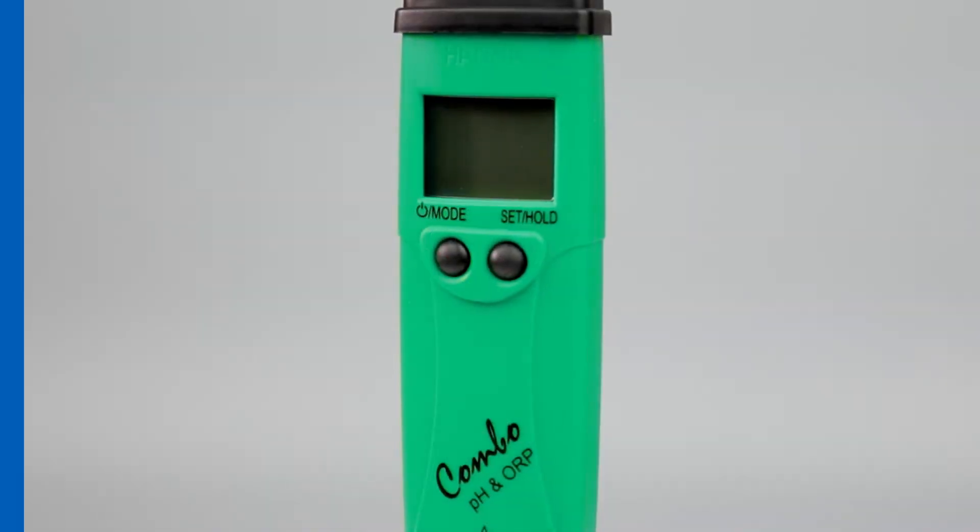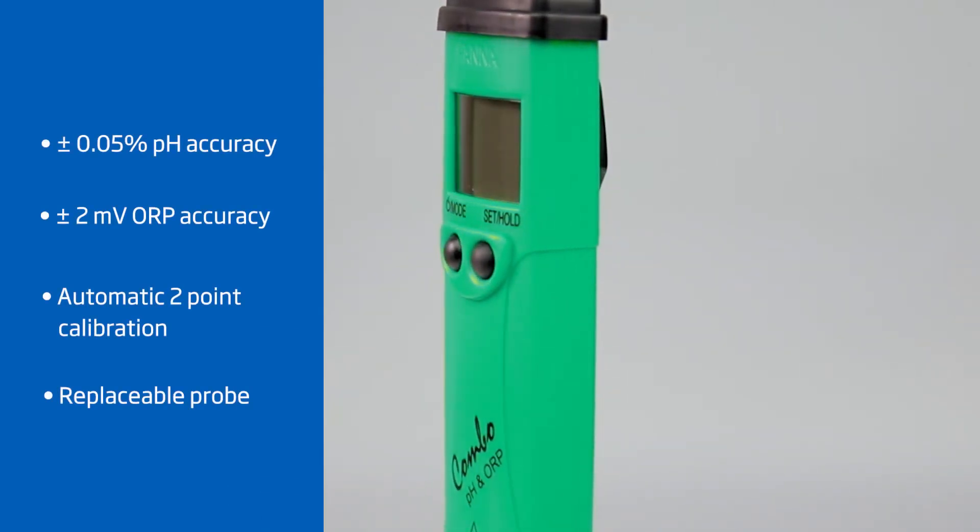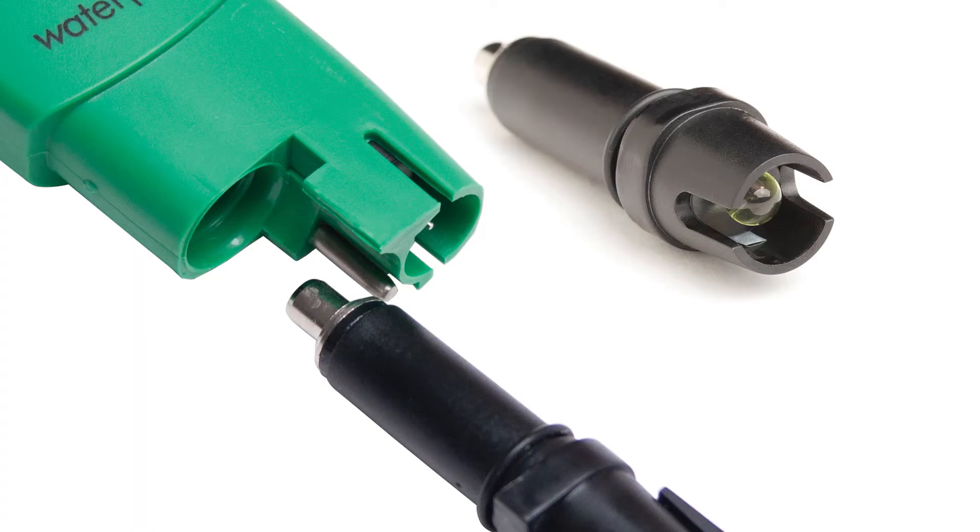It has an accuracy of plus or minus 0.05 pH, plus or minus 2 millivolt ORP, and automatic two-point calibration. The replaceable probe keeps your tester working far past any other combo tester on the market. Hanna Instruments provides you with affordable and accurate equipment to help you achieve professional results.